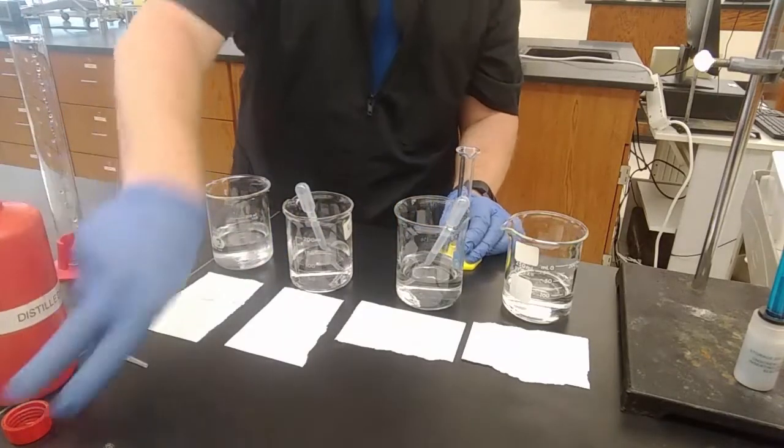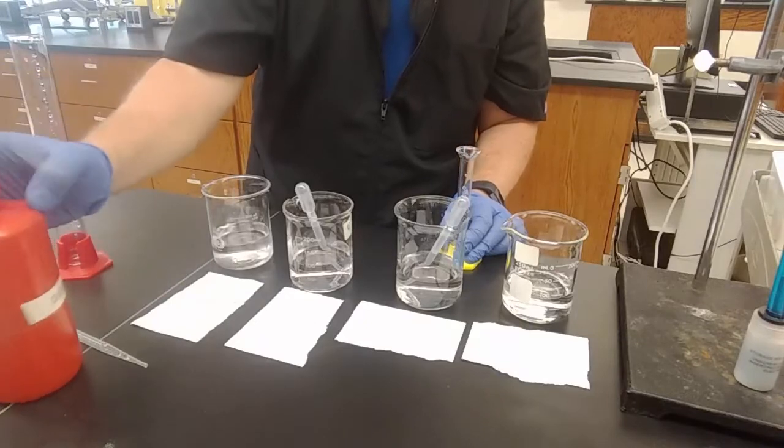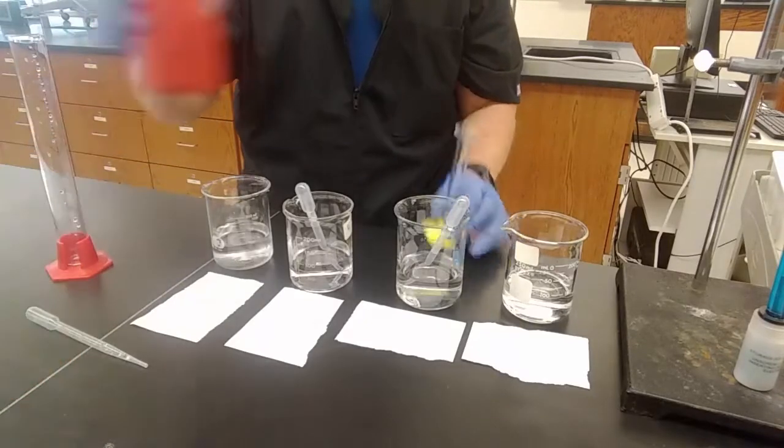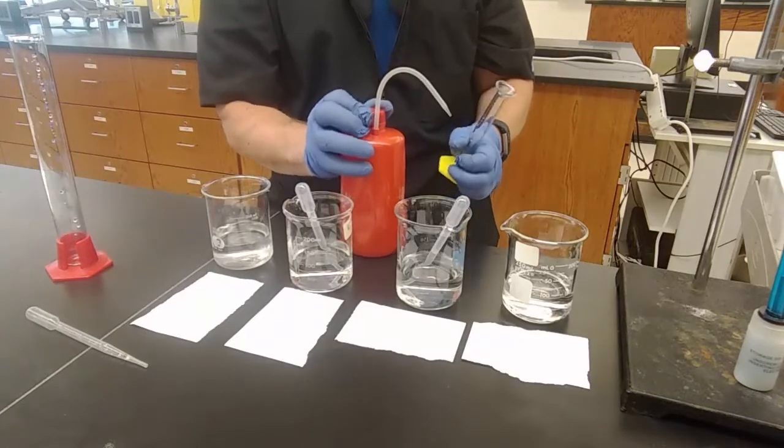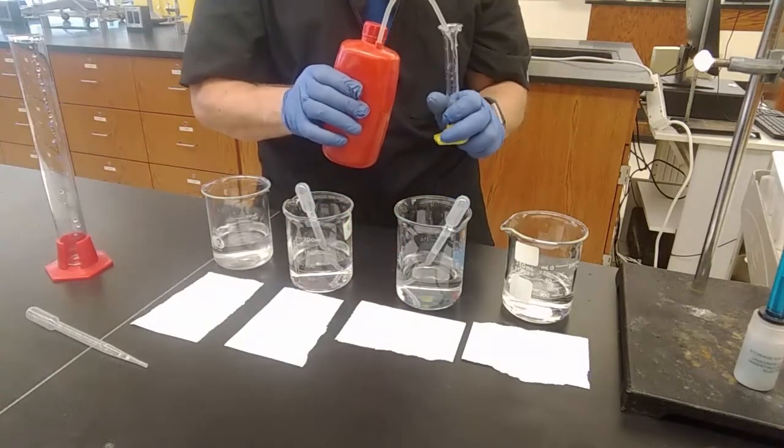Okay, I want to rinse my 10 milliliter graduated cylinder with a little deionized water, just in case it's got any residual from the last one, which would be much more concentrated.